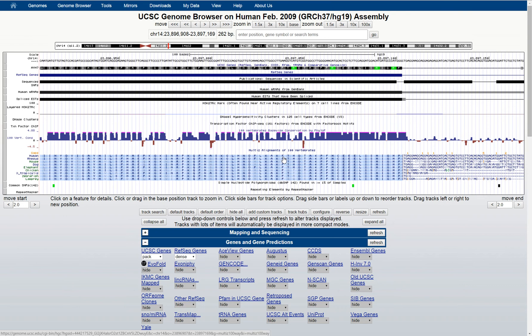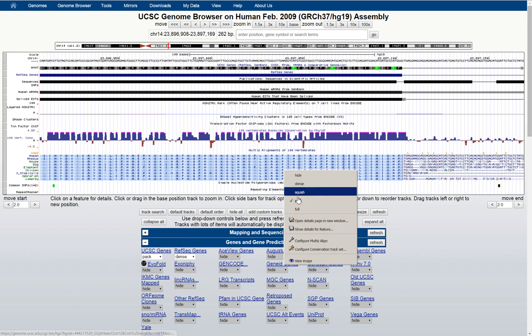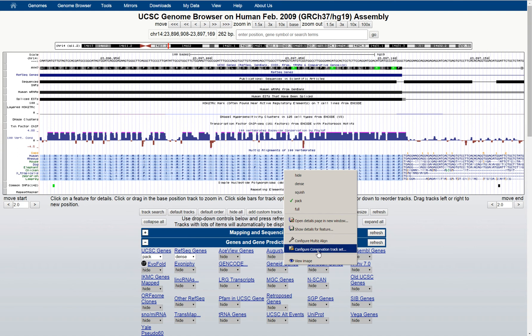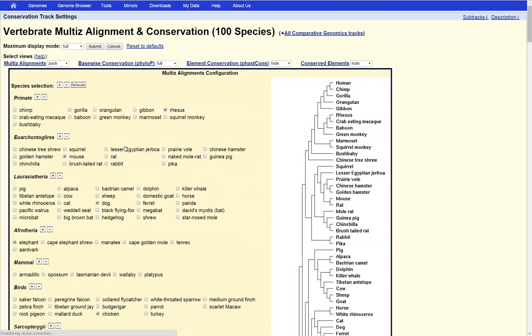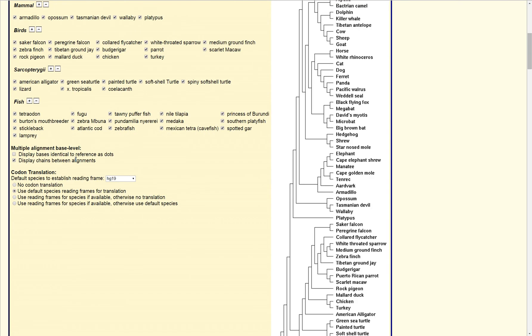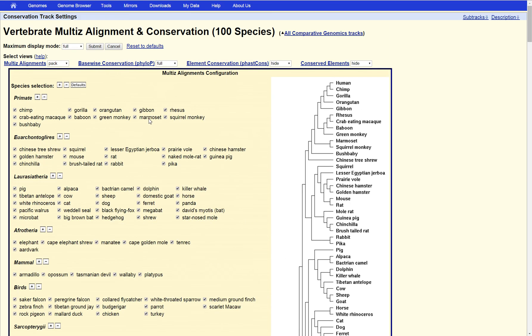I do not know how to get this highlighted naturally — Exact has a way to do that when they link out to UCSC, so there may be somebody who has input on this and could put that in YouTube comments. Nonetheless, you want to expand your conservation track a bit beyond what's displayed here, so you can select all species by clicking that plus button, and then display identical reference amino acids as dots to make it easier to see any discrepancies. Then hit submit.